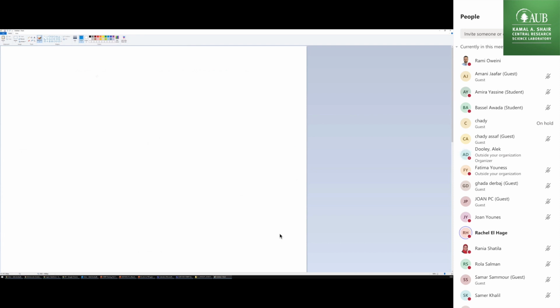So hi Alek. I just want to introduce a little bit our samples. Our samples are polychlorinated biphenyls in biological samples. People in the literature are working with these compounds in gas chromatography since they are non-polar compounds. So we wanted to ask if these compounds could be analyzed on HPLC QTOF.